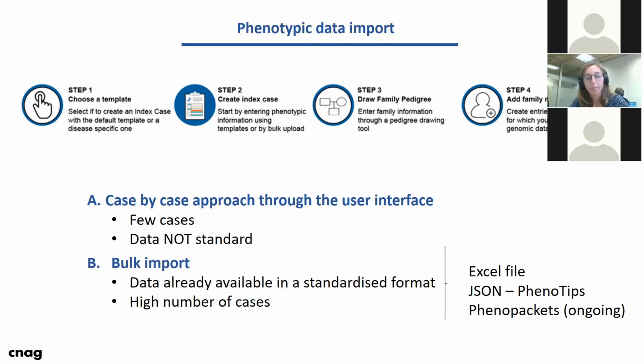So we provide a template where you will be able to add all this information, but we are also compatible with Phenotips and the JSON files that they export. And we are also currently working on being able to import these phenopackets directly on our system.